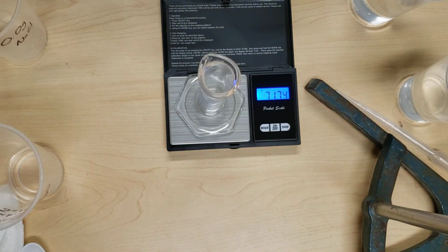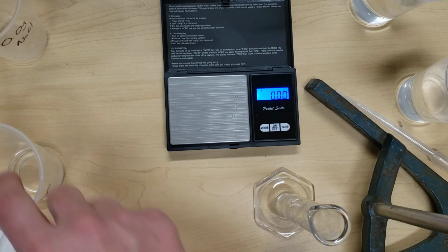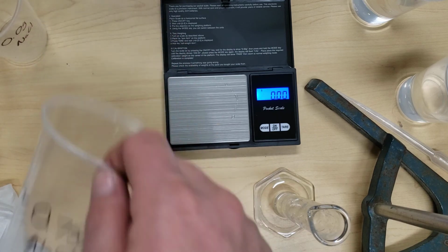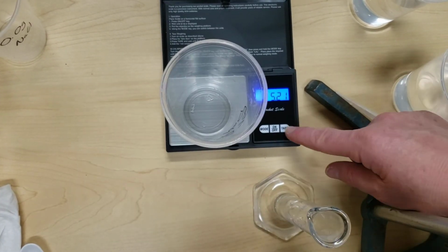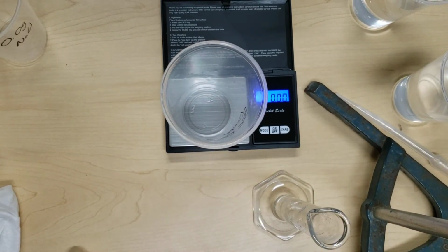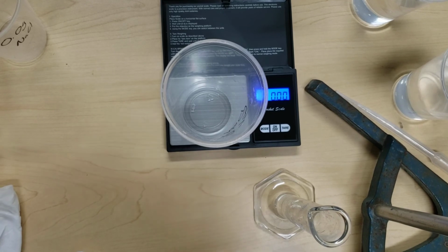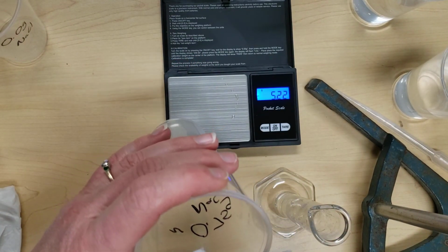Okay. Next, we're going to weigh out the salt. So we want to use our cup that says 0.75. We can put that on the balance and hit the tare button. And then we're going to weigh out about 0.75 grams of salt.